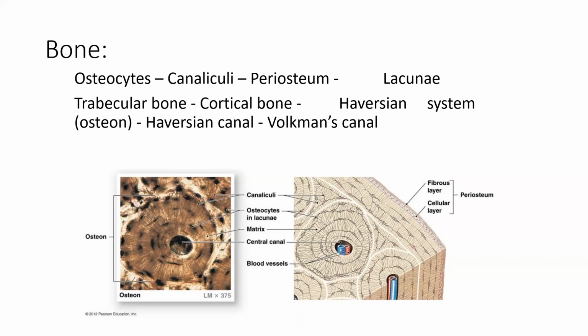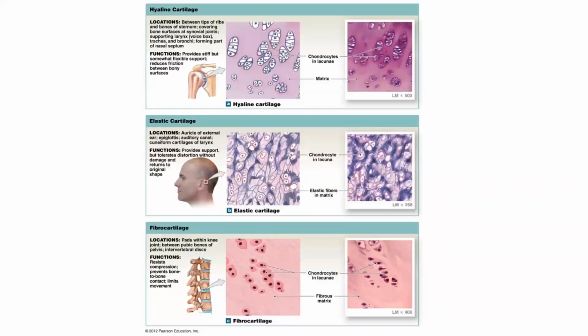There's another type of bone that we typically refer to as the bone marrow that has the presence of adipose tissue. That's known as spongy bone or trabecular bone. All of those terms can be interchangeable. So if you see a bone-like structure with adipose tissue in between, you're most likely looking at some sort of spongy bone.